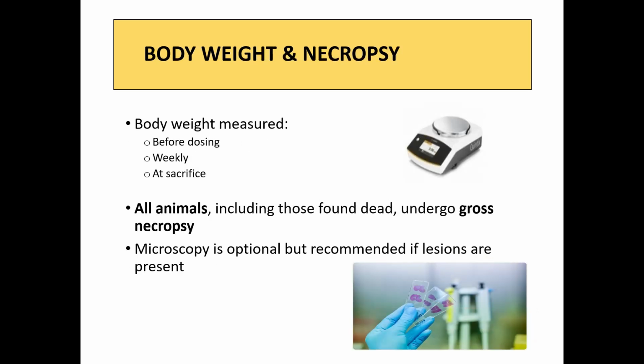Body weight and necropsy. You have to take the body weight of the animals before dosing, also for dose calculation, and weekly, and at sacrifice, because it is a 14 day study. While you are sacrificing animals, you have to take the body weight to calculate relative organ weight. I have already shared the video for this also, on how to calculate relative organ weight.